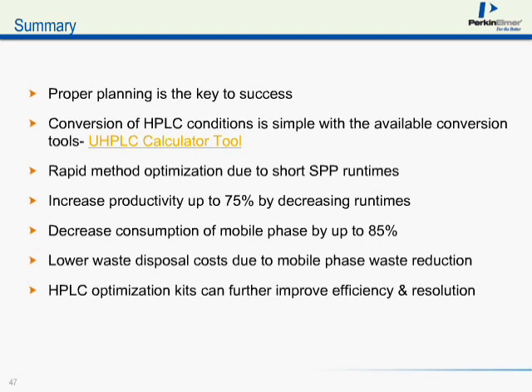Well, I flipped back to this slide shown here. And if you'll notice, before and after on that optimized system, I used a 10 millimeter path length flow cell in the non-optimized system in the top chromatogram, and a 6 millimeter path length flow cell in the optimized system.